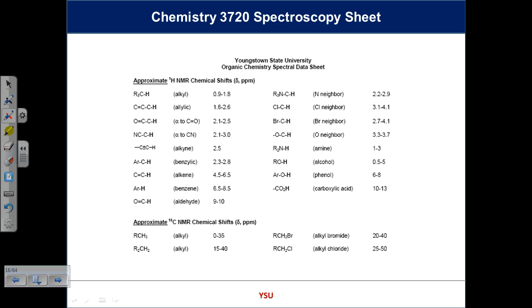Now, we cannot possibly cover every single organic molecule that is out there. So occasionally, you might see a proton that's outside of that range. But if we do this properly, and you practice and I present this properly, you should be able to handle why that happens. Why is a signal showing 2.2 ppm further downfield than I expect it? And chances are it's because there's something close by that's electron withdrawing. Okay, so all those ideas will be useful here.